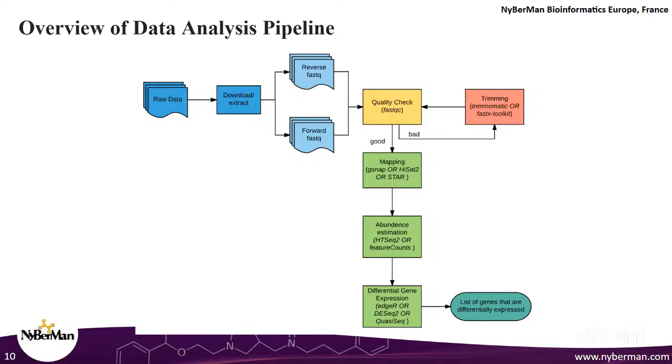In paired end sequencing, we sequence the same molecule two times, once from 5' to 3' and then again from 3' to 5', which is what you guys saw yesterday in that Illumina video, if you guys remember. If not, please go back to that video. It's a YouTube video that has been posted by Illumina themselves. Go ahead and check it out. The sequencing that you saw there is known as paired end sequencing. And it is always a good idea for your RNA-seq experiment to perform paired end sequencing for the purpose of having higher confidence.